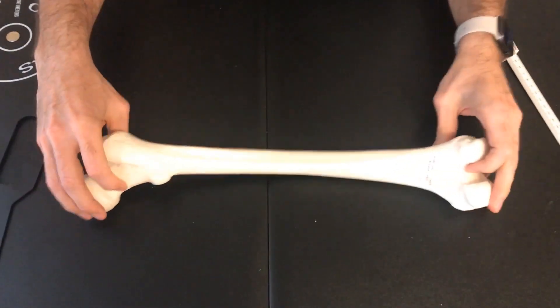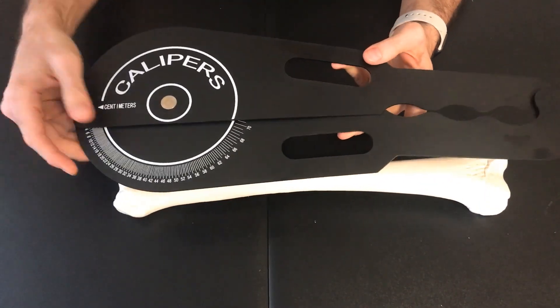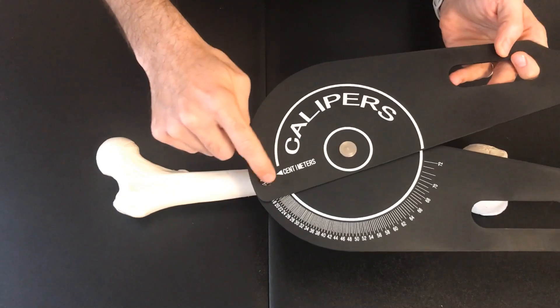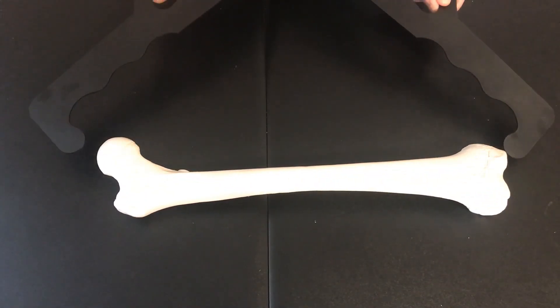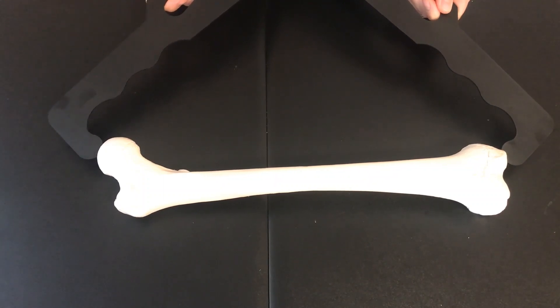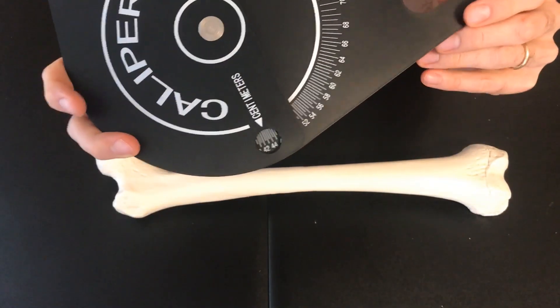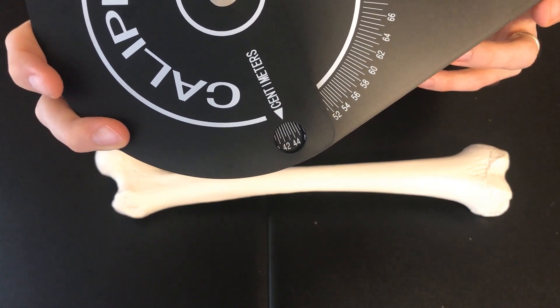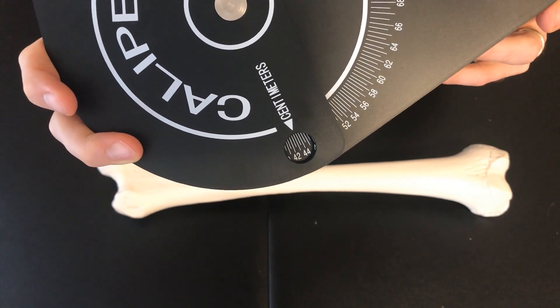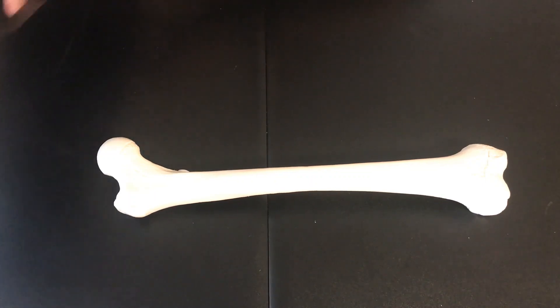For the next measurement, we're going to use these special large calipers. We take the measurement between the two points and take a reading. We go from the largest possible distance from the head to the condyle, and we see that we are at approximately 43.5 centimeters, or about 435 millimeters. Typically males are above 430 millimeters, so again, this measurement is consistent with a male.